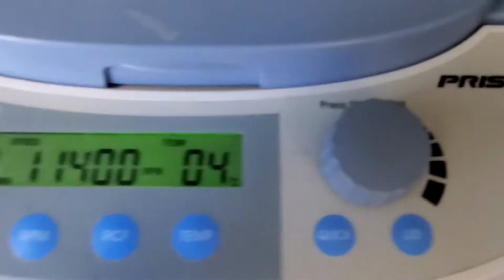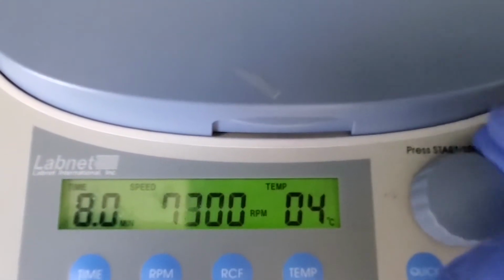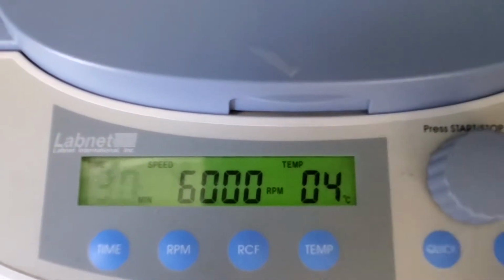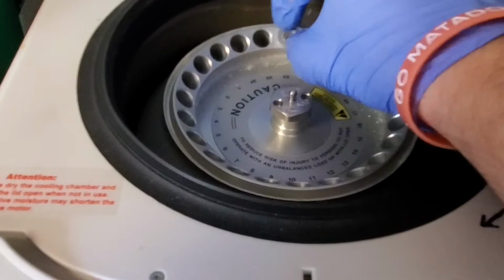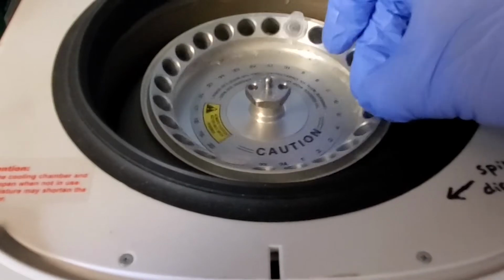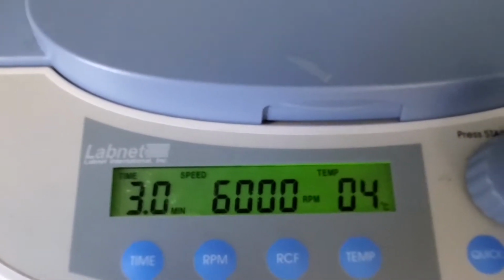For the centrifuging step, make sure your cooled centrifuge has reached the right temperature, usually +4 Celsius. Also, of course, set it to the right RPM and time. Touch the rotor with your finger just to make sure it's actually cold. Don't forget the inner lid. And begin.